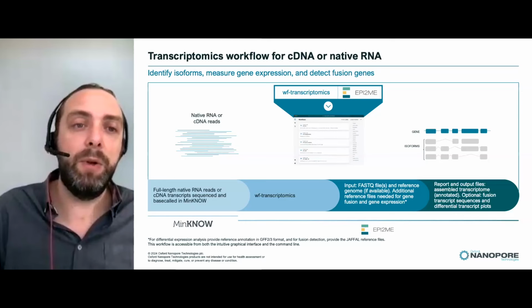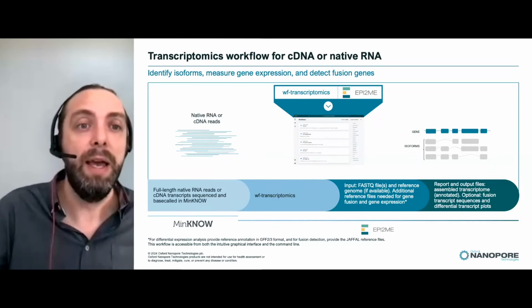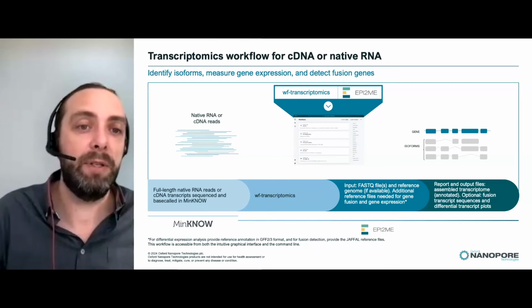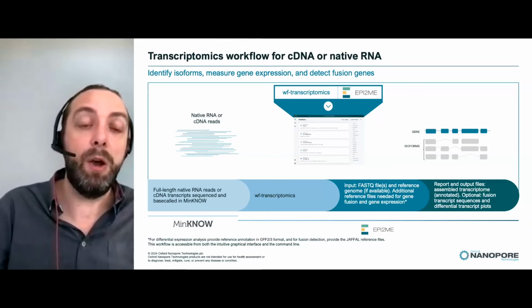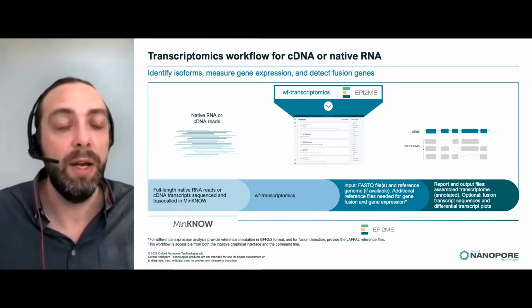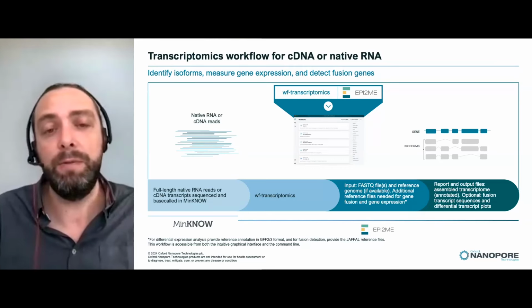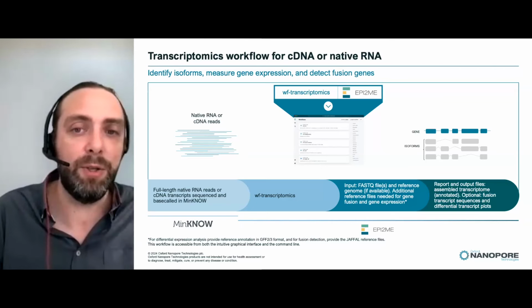And by doing so, it allows you to look at isoform specific expression, and not just gene level expression, but to go down to transcript level expression, which again is helping us resolve the underlying biology around different types of tissues, different types of diseases, or experimental conditions.